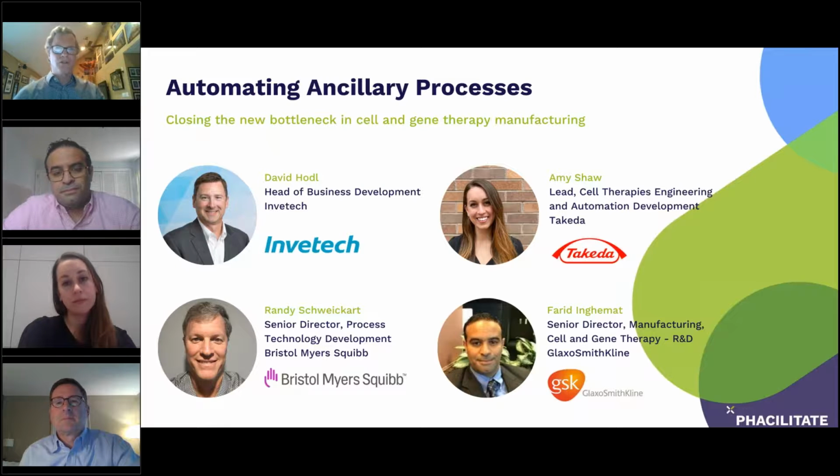An example might be, you're interested in an all-in-one type production system for your process. Figure out how you can get to those systems, use them early on, understand them, because again, the advantage we have in the autologous space is you're doing a scale out, not a scale up. So the automation that you use in that core processing, and ancillary space as appropriate, is the same automation that would be used, especially in the core process.